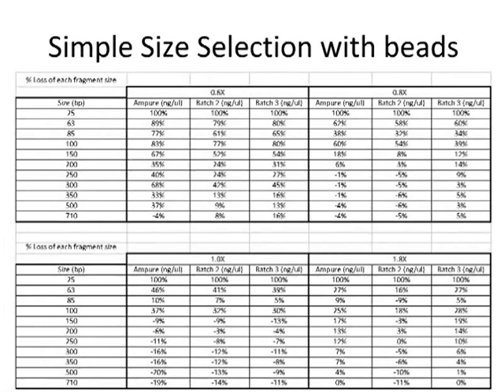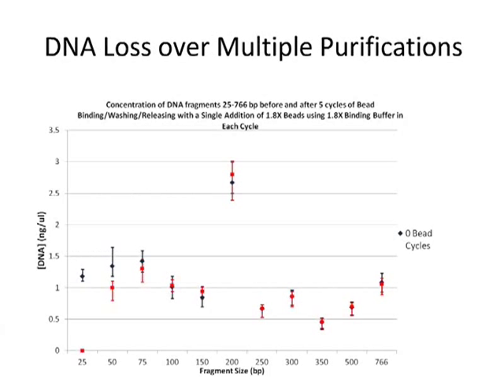And as you get up to larger fragments, you see essentially no loss at all. So you can tailor this percentage to get size selections in the 100 to 300 base pair range that are pretty efficient. Or arguably what we use it for most is just making sure that whatever adapter design, or adapter plus PCR primer, you're using, you can eliminate those products.